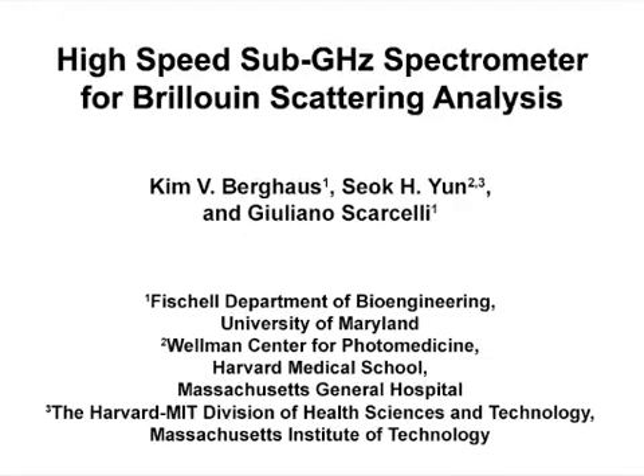The overall goal of this spectrometer is to measure Brillouin scattering signatures of tissue and biomaterials. Brillouin scattering spectra provide non-contact, non-invasive information about material properties such as the longitudinal elastic modulus. This method can help answer key questions in tissue biomechanics — for example, in corneal tissue we can measure the corneal strength for diagnosis and treatment of keratoconus.